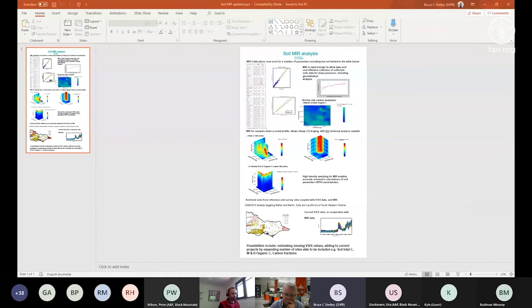There's an issue when you've got recalibration or modifications to calibrations. If I run the sample through with my current calibration, how comparable is that to the same sample run through with my models from 3 years ago? So particularly with things like carbon, where it's slow change and you're talking about 10 years minimum, that will impact the value of the two results. Sample prep we've already covered.